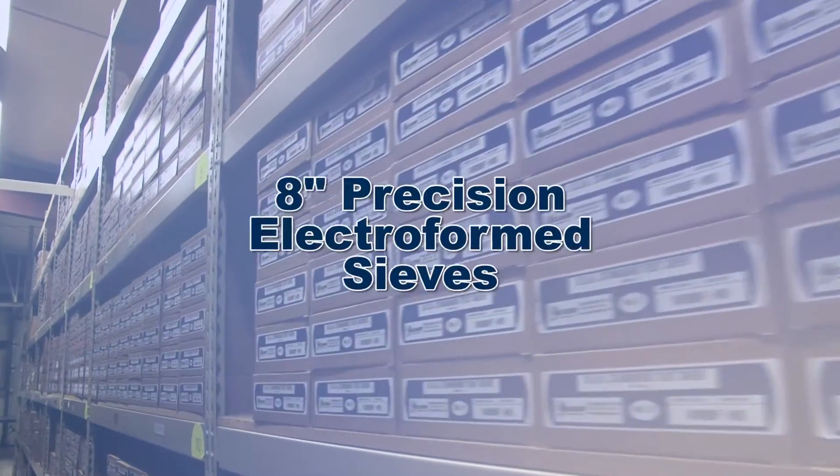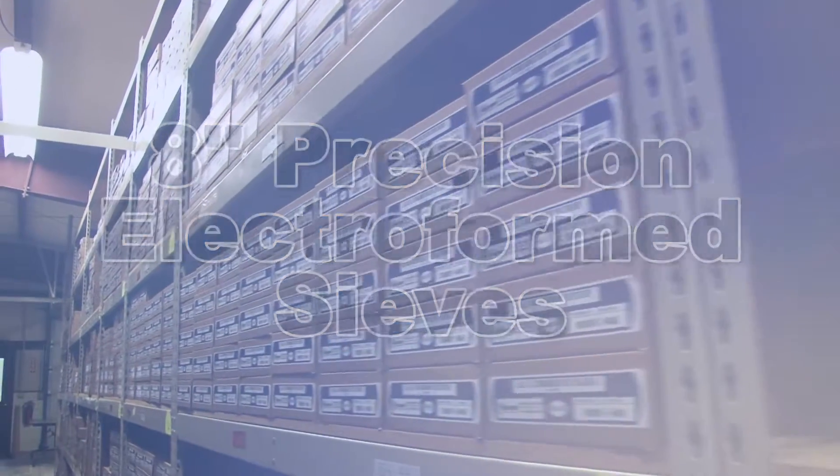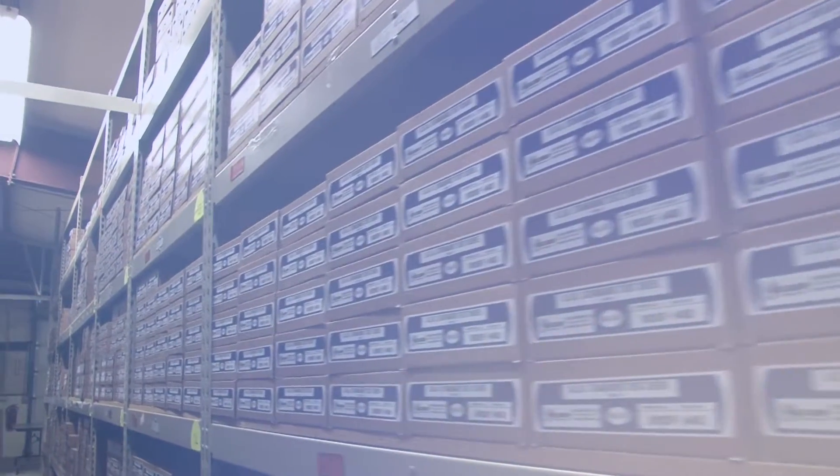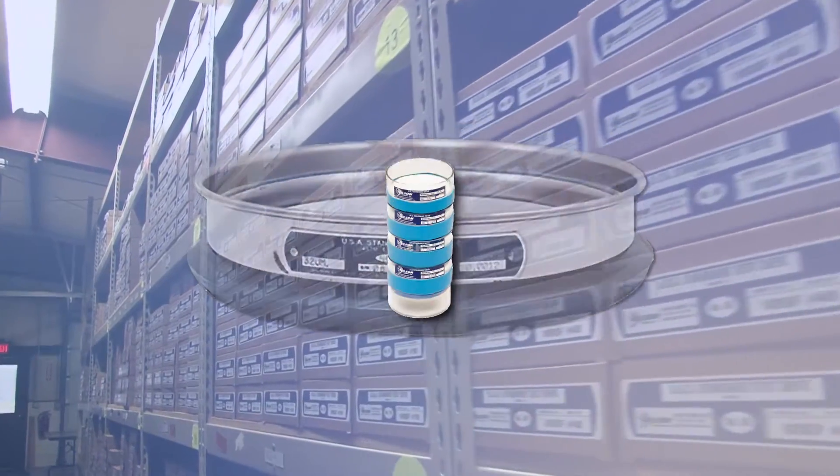Gilson also offers precision electroform sieves in an 8-inch stainless steel frame, as well as a variety of other sieve types including airjet sieves and non-metallic sieves.